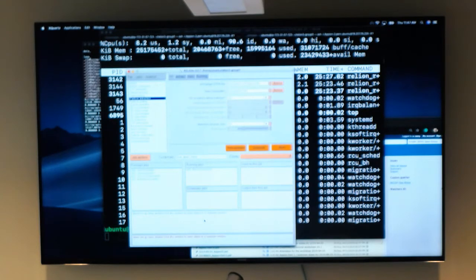Yeah, that's two classes. So after you're done with this entire step, we can see this step. Yes, you read the classes. Yeah, I think so, otherwise you can be getting garbage. It's kind of slow, and so you have something called the model load step. This is the reference one, in case you want to do it. And so there's three, and I have an option of sorting it.